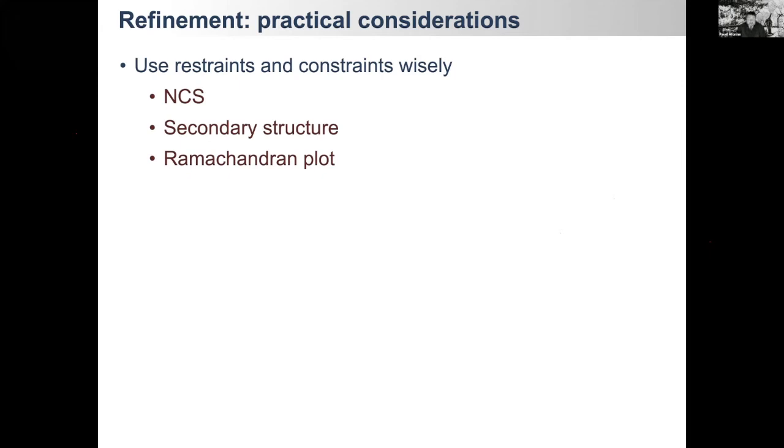The secondary structure restraints are conceptually very similar. Basically, it's a point when the map does not allow you to see the differences and details of secondary structure geometry.